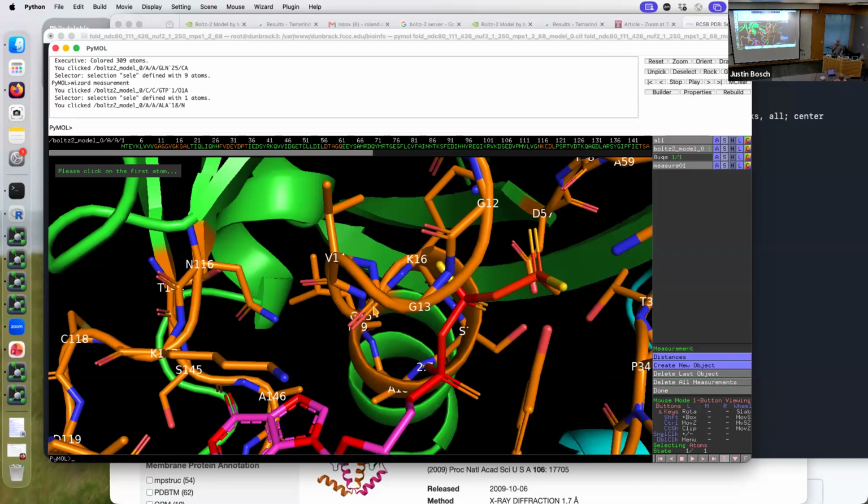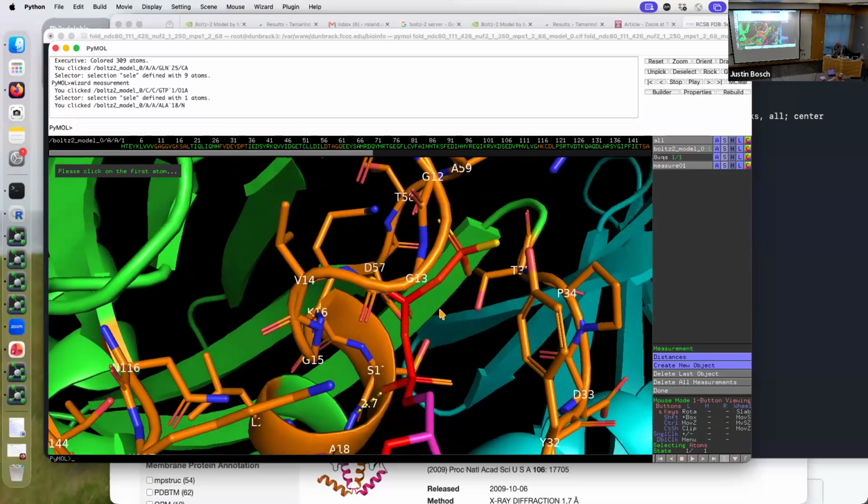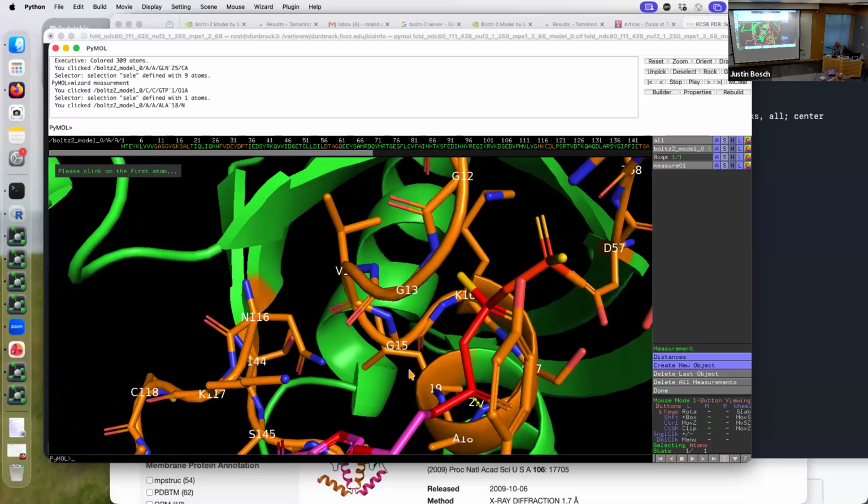But you need to look at the structure, and it needs to agree with what the PAE diagrams are telling you, or what the AlphaFold scores are telling you, or what you know about how the proteins interact. You want to see it inside the structure. Can't emphasize that enough. And so you can poke around and basically click on a lot of things.